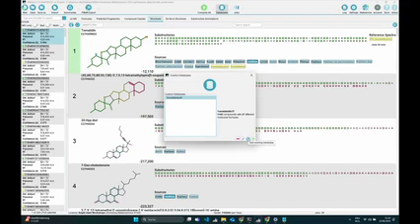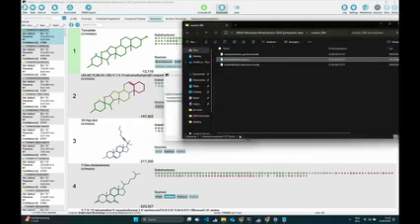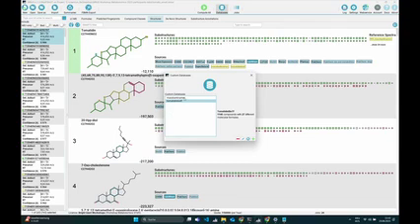And let's also now add our other custom database, and this is our spectral database. If you want to create it anew, I'm not going to show this now, but you can just import the spectra if you create a new database. But we have one already made, which will be the MassBank names spectra .seriusdb, and we will just open this. This will now be our second item in this list. And we can see this MassBank names database actually has a lot more compounds and close to 100,000 reference spectra.